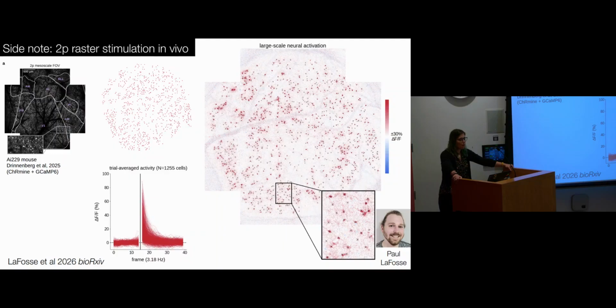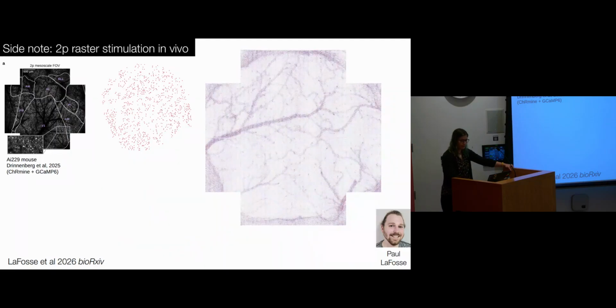Yeah, so that's why I was trying to see if there are areas which were bright here, which were not targeted, to see if there are other neurons. I couldn't spot too many, but I didn't spot Waldo either, so I don't know. Right now with this, we're stimulating a lot of neurons. What we've seen, and this is in the preprint, which was just updated too, is that close to the neuron being stimulated we see more activated neurons, but then we see suppression a bit further away from the targets, which people have reported before, this inhibition. And we have a lot of targets here, so we see a lot of inhibition actually. But we're still working on analyzing non-targeted cells.